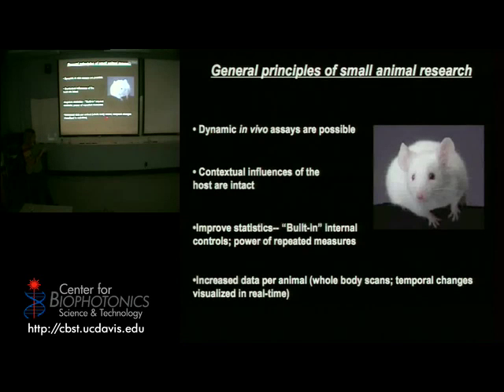And you also gain a lot of insight into things you never really even knew were going on. You could see, oh my goodness, all of a sudden this cancer has metastasized to this lymph node in response to this drug. You never would have known that before because you never would have known to look in other areas. And so it's become this remarkable research tool for discovery, enabling advances in the clinic just by highlighting where different cells are and where different things are occurring.